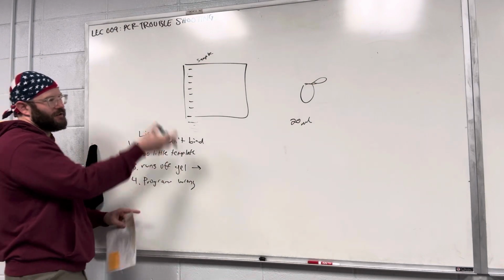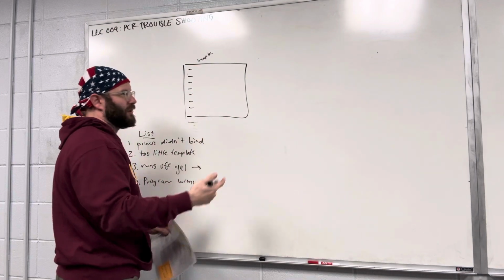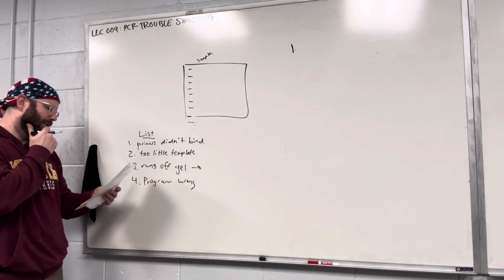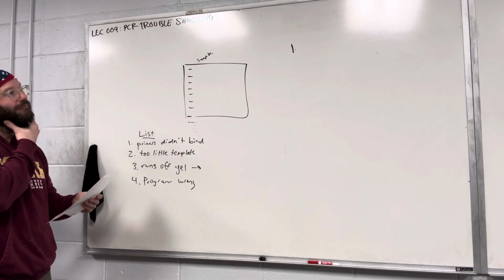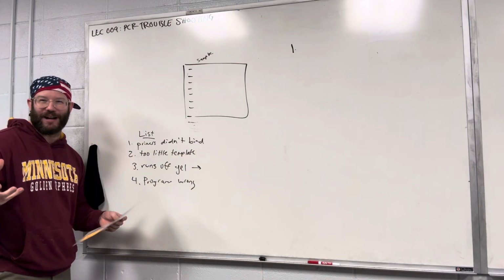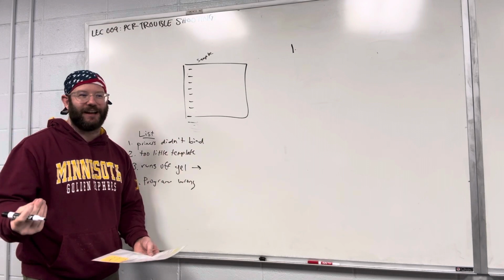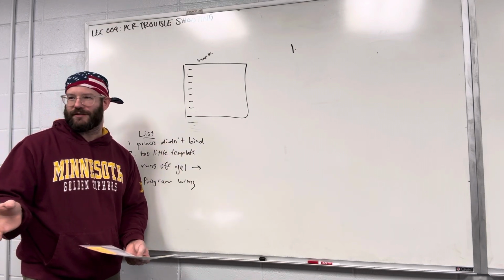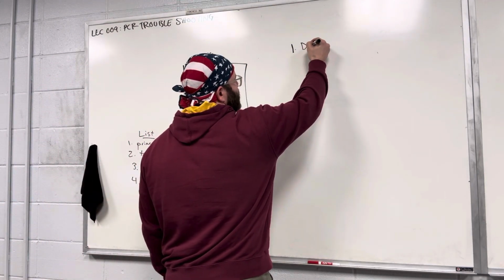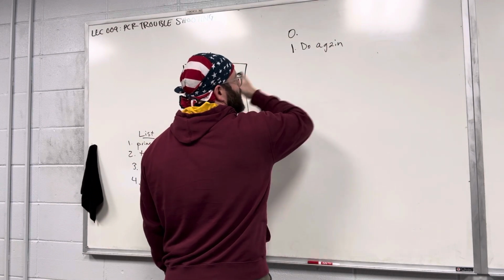If you run a PCR and you don't see anything, what should be your troubleshooting pipeline? What should you do right away? A second PCR. Yeah, actually that is usually what I always say. If a student does something and it doesn't work, I always say, do it again, because usually the first time you do something, you fail in science. So that is a good one, just do it again. Although before you just do it again, there are some things you should check.